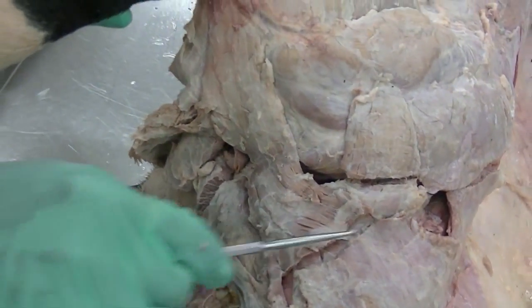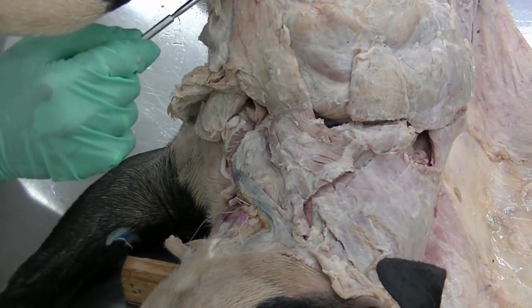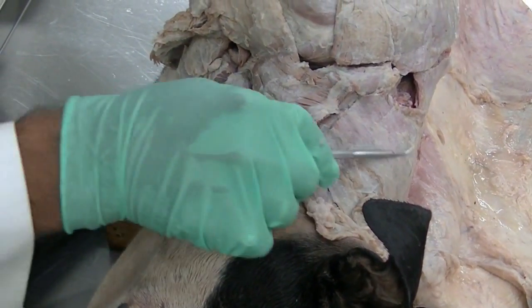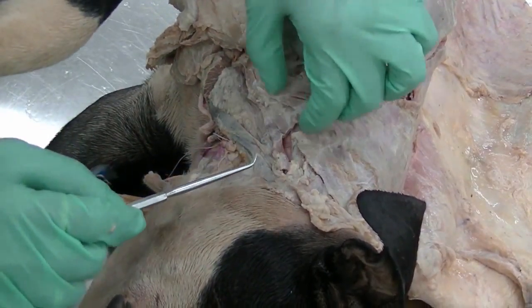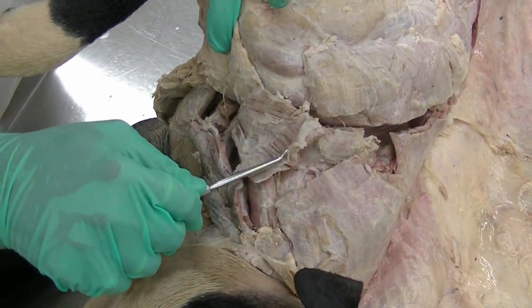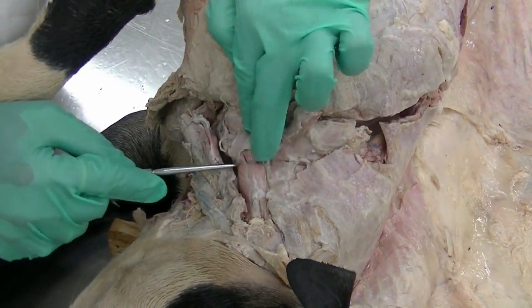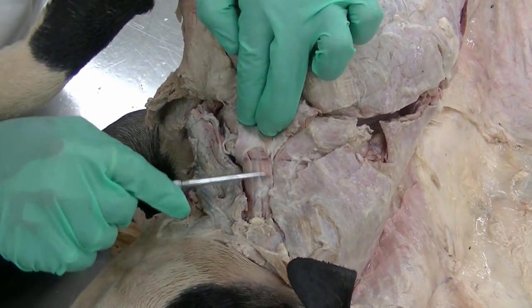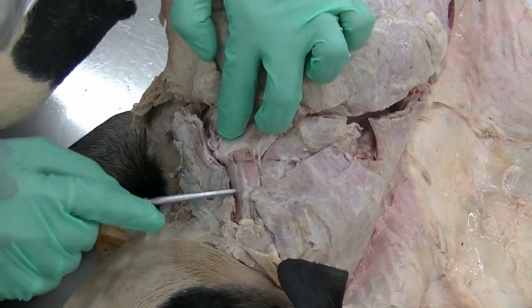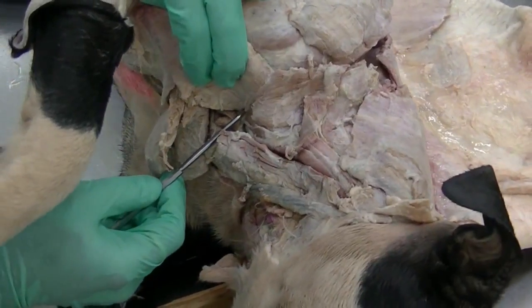So the brachiocephalicus, as an entire muscle, has two different parts from the clavicular intersection: cleidobrachialis and cleidocephalicus. The cleidocephalicus is further divided into cleidocervicalis and cleidomastoideus. As we transected the brachiocephalicus, we can see that part of the cleidocervicalis has been transected. As we reflect it more laterally, we can see a little spindle-shaped part, a little thicker than the flat cleidocervicalis, that is your cleidomastoideus. Both of them diverge from each other from the clavicular intersection.